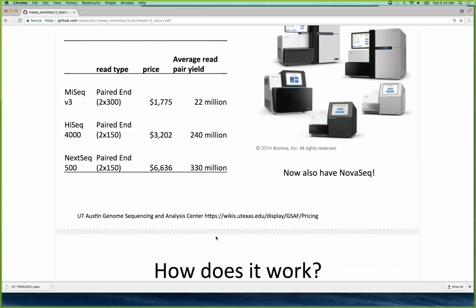So they'll have really good internal rates for their faculty and staff. But if you're going in as not an employee of that university, then you may be paying a lot extra. So it's good to shop around, figure out what the prices are. Yeah. So that's when I would do the long reads versus the short reads for sure.